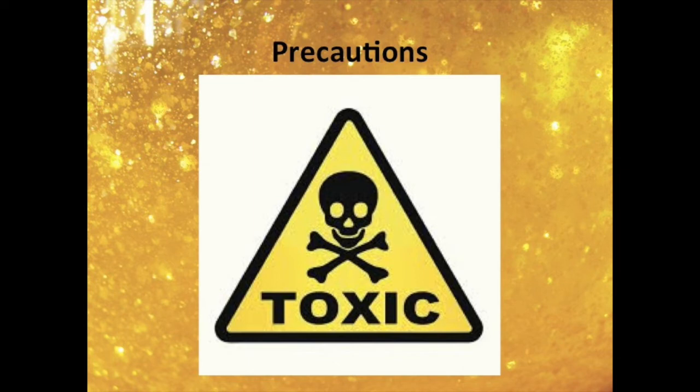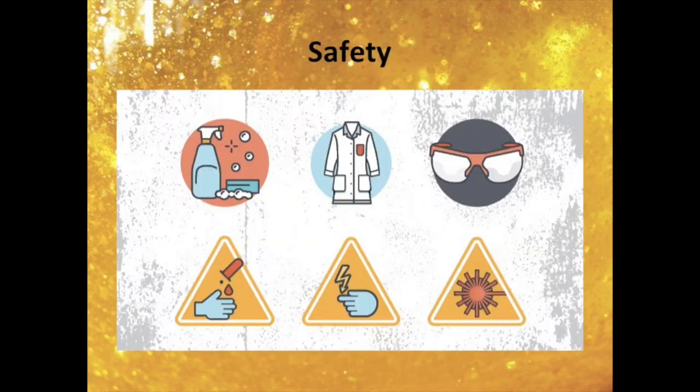There are a couple precautions we should take before conducting this experiment. The first one being that lead compounds, especially soluble lead compounds like lead nitrate, are very toxic. We should also follow our safety standard procedures, including wearing your safety goggles, apron, and gloves at all times. Without further ado, here is the video of our experiment.